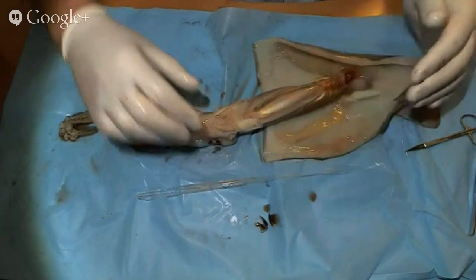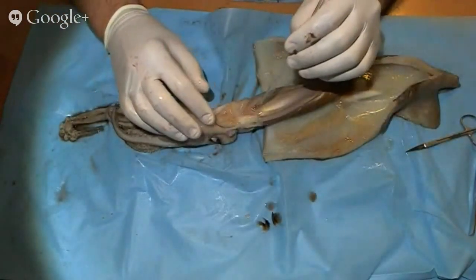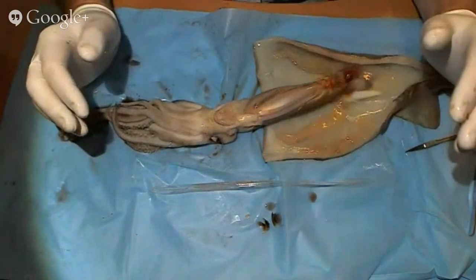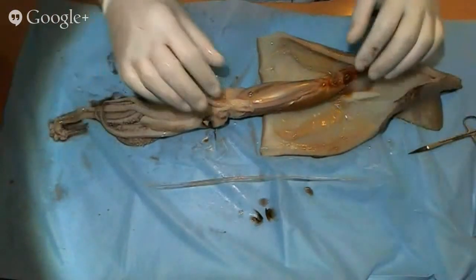be pushed through here. So, kids love to do this too, where they'll break open the ink sac and then they'll write, or I've seen kids do mustaches, I've seen kids write their names on a card and then take that home, all sorts of different things.